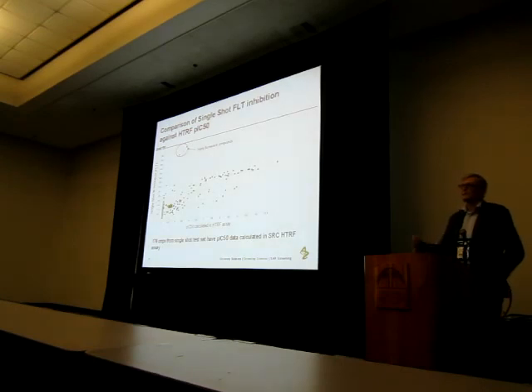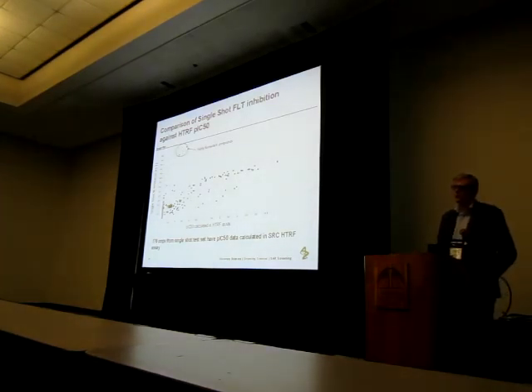Now, 50% inhibition, we started with a 10 micromolar compound concentration, so you would expect it to be around the micromolar range, and that's exactly what you see here. So that gave us some confidence in terms of that correlation.